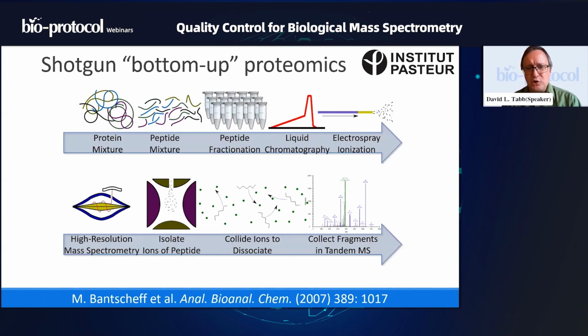For many people, shotgun proteomics may be a bit of a black box, and that black box can occur on several different levels. I've met a fair number of bioinformaticians who are less than clear on what happens on the bench when someone is manipulating the sample to get it ready for an LC-MS/MS experiment. I've met a fair number of people who want to think of the mass spectrometer as a black box: stuff goes in, magic happens, and out comes your data volume.